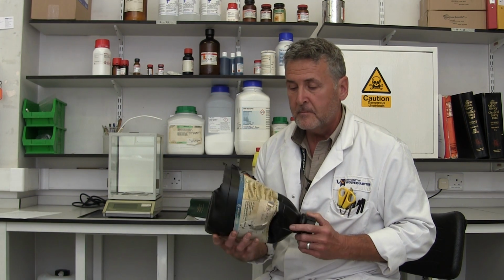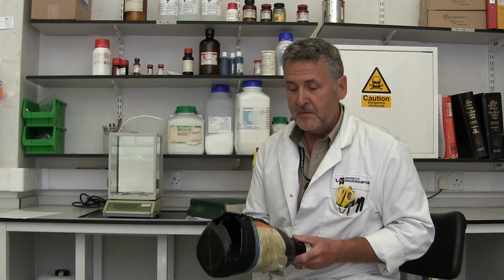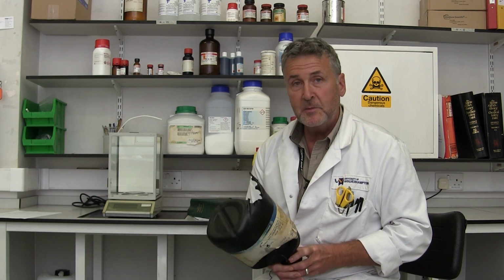As an example of what can happen if you don't do what CoSHH tells you to do and you panic, or you just decide to ignore CoSHH anyway and do it your own way, have a look at this. This happened in the project lab a few years ago, but I kept it as a souvenir. A student decided to dispose of a chemical they didn't want in the nearest available, what they thought was empty container. This happened to be lying on the bench.